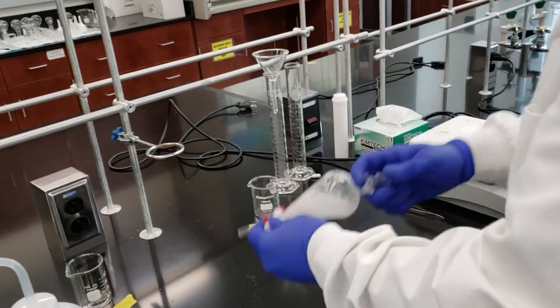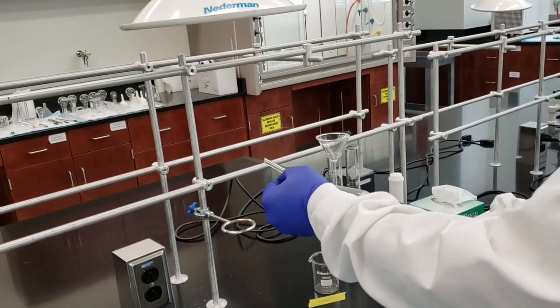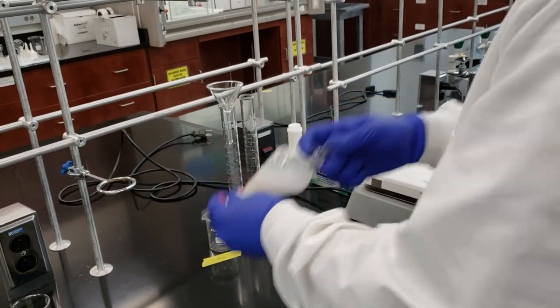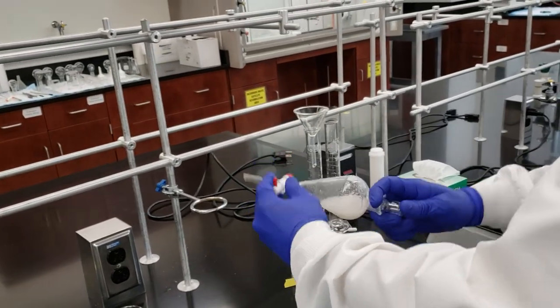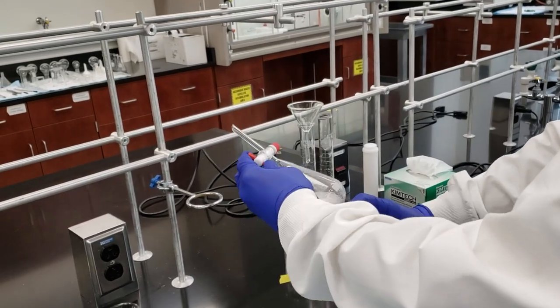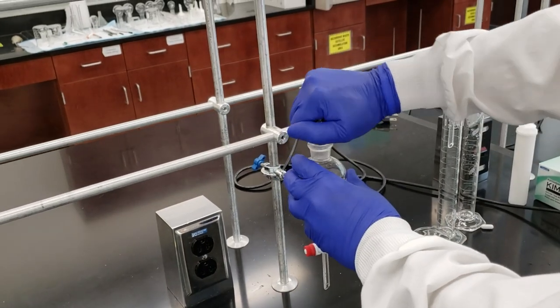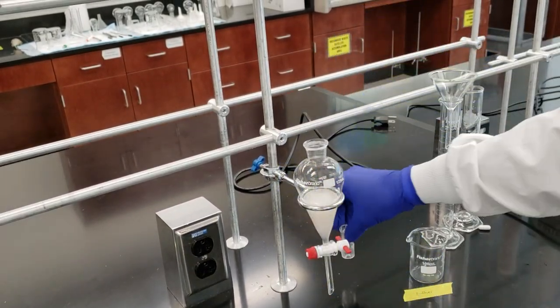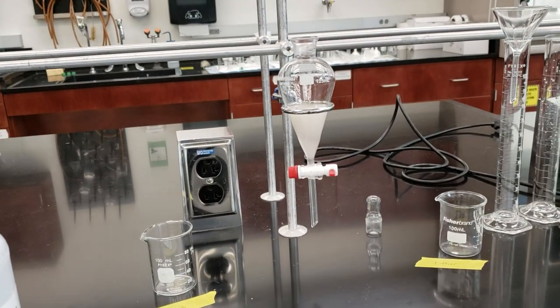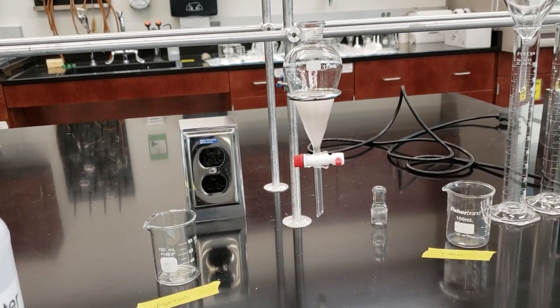Just as we've done in the past, we give it a shake, and we vent it out and away from us towards the snorkel. Vent, and then a third shake, and a vent. Put it back in our ring clamp, and get ready to separate our layers. Now let's take a look at our distribution. It's going to take a little while to fully separate. We'll give it a moment. Once the layers have completely formed, we'll go through the process of separating our layers.